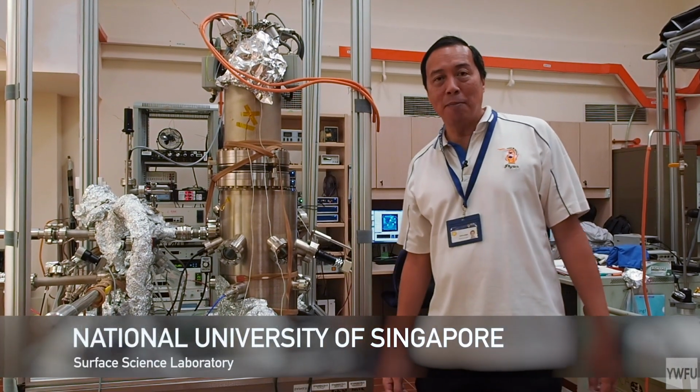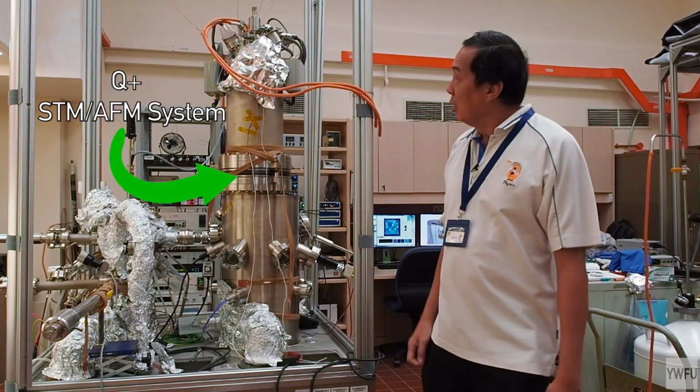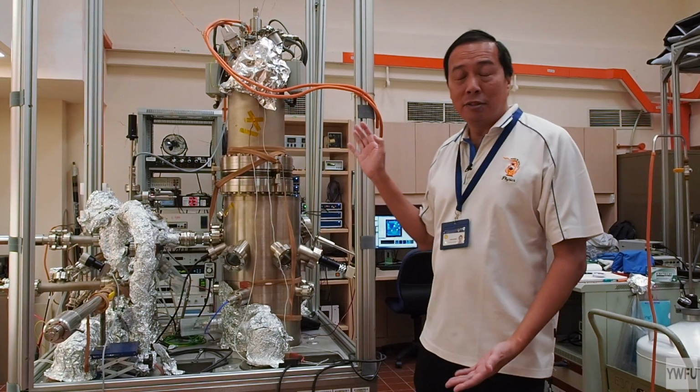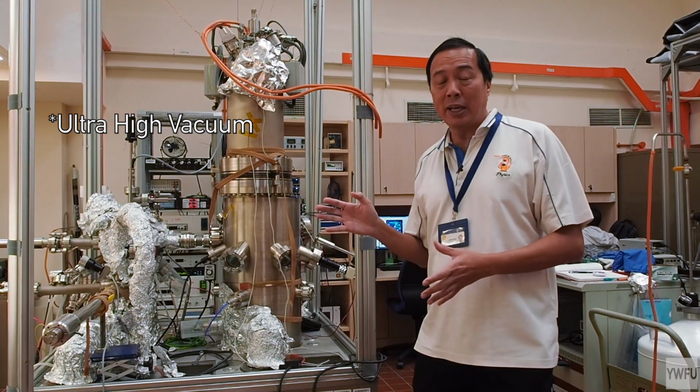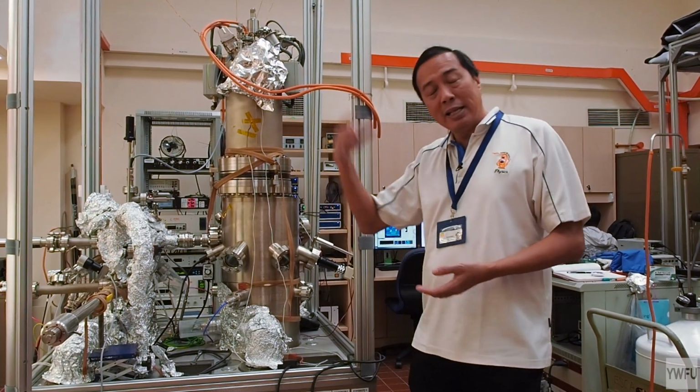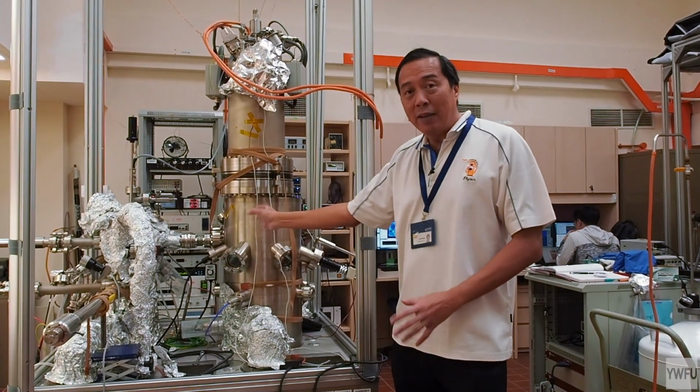Okay, sir, so are we able to view the STM and AFM techniques in NUS? Certainly, I can bring you down to my lab downstairs to see the STM and AFM instrument. Let me take you. Hi, welcome. We're in the Surface Science Lab, and this is Q+, our STM AFM system. You see a lot of stainless steel, and the reason is because it is in ultra high vacuum, which is 13 orders of magnitude below atmospheric pressure. It's like outer space. So everything inside this chamber is in a really very high vacuum.